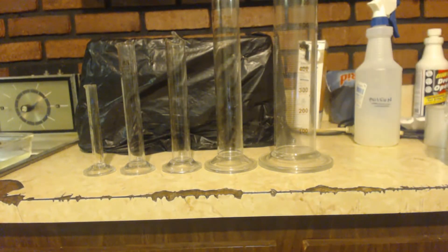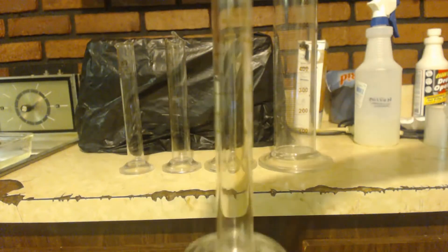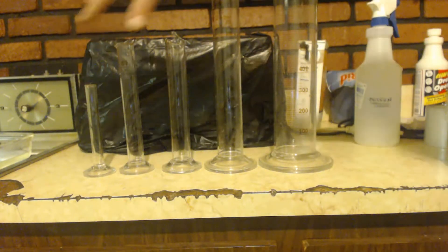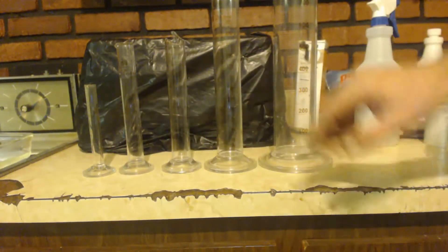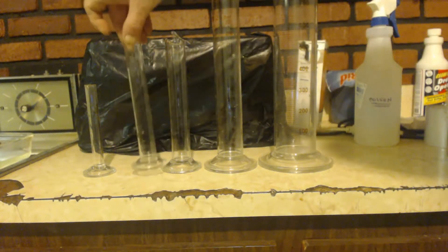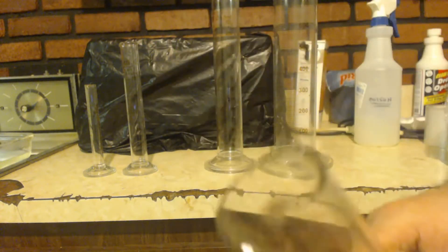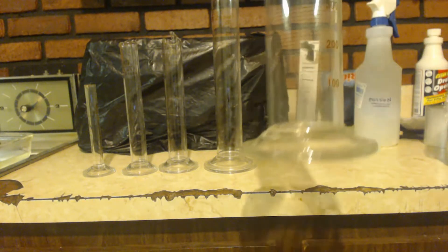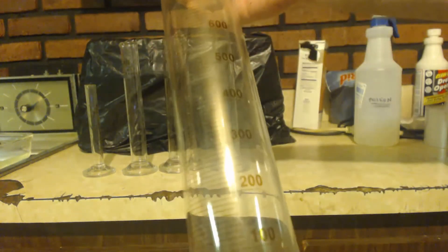I just wanted to show my graduated cylinders. You can see it starts out — I've got a little 10ml, which I usually use for density because it's nice and light on the scale and you don't need a lot of product. I've got a 100ml one that I broke, but it still goes up to 100ml so it still works. Then there's a 250ml and the big one — the 1000ml. That thing is giant.